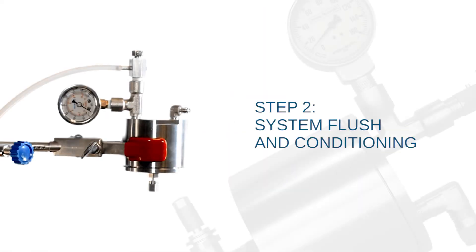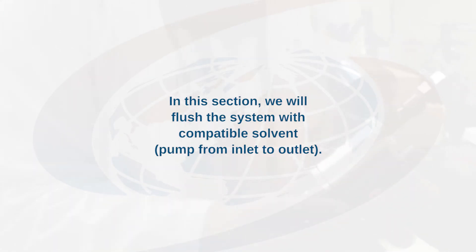Step 2: System flush and conditioning. In this section, we will flush the system with compatible solvent, pump from inlet to outlet.